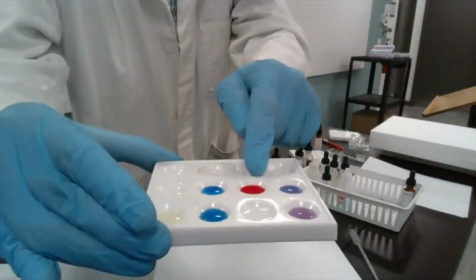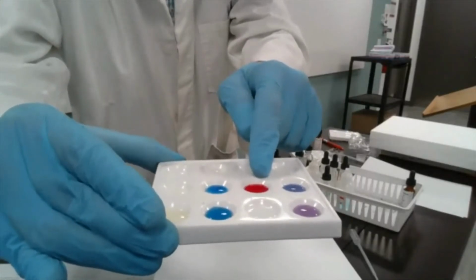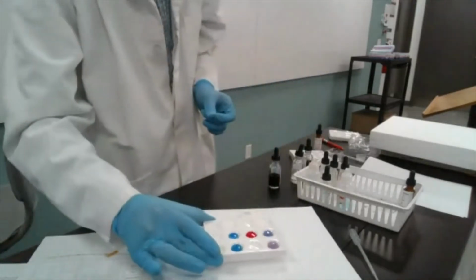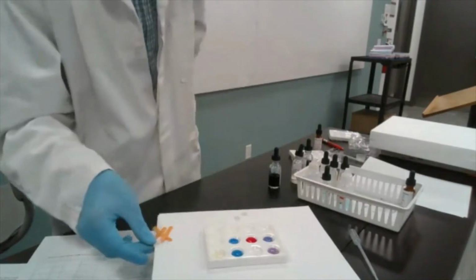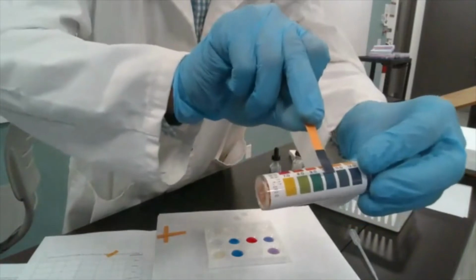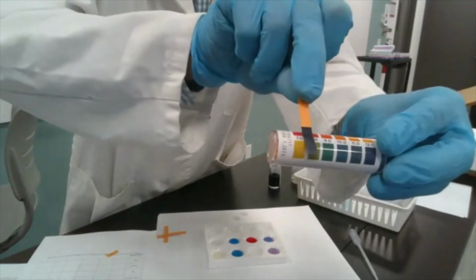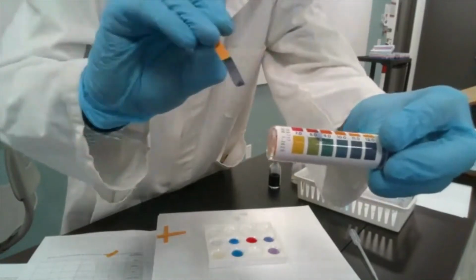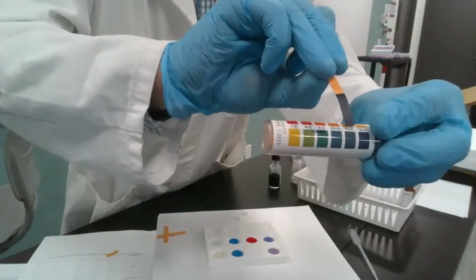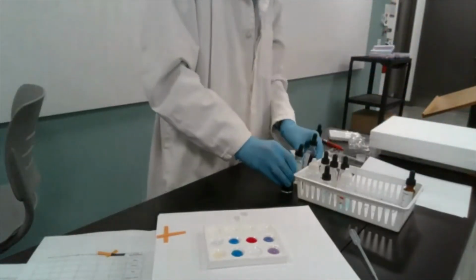And phenolphthalein with sodium hydroxide is deep pink, almost red to me. And bromothymol blue remained blue. And let's see what the indicator paper tells us. So I'm going to dip it into the solution, and bam, that changed to a really deep color. So I would say this is something, you know, it's kind of displaying everything to me in a mirrored pattern, maybe 11, 12. Yeah, probably 11.